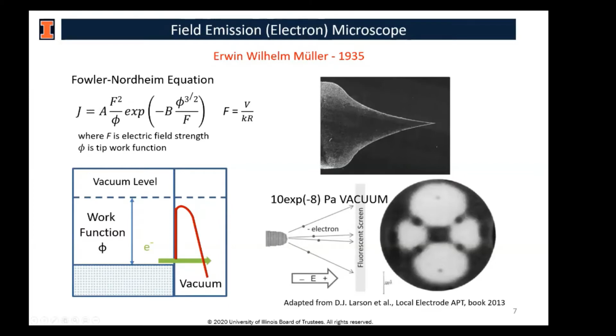So this is, in a sense, also a map of roughness of the surface, because for BCC metals, the 0, 1, 1 plane would be very flat. The other planes would be much rougher, so they have a lower work function and appear brighter. So higher work function, dark; lower work function, bright.